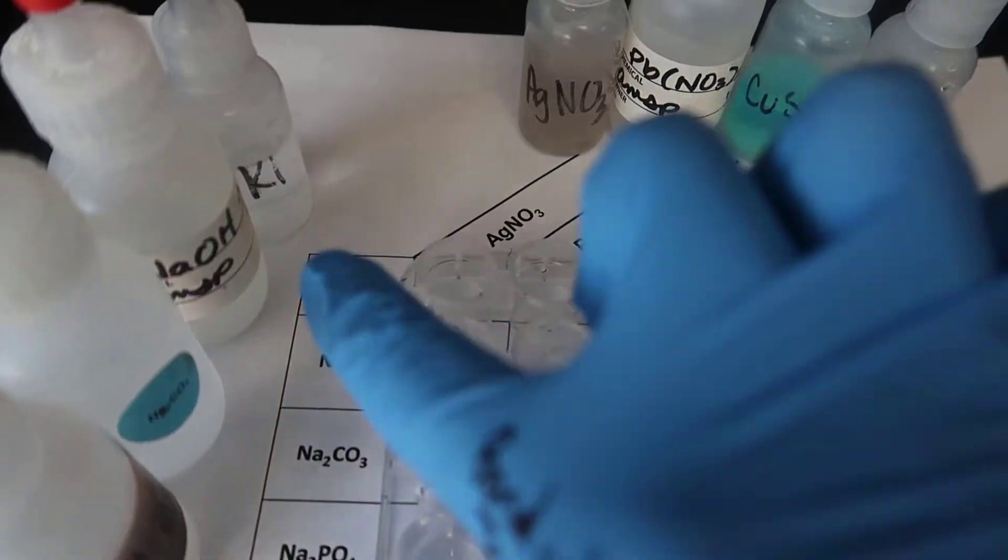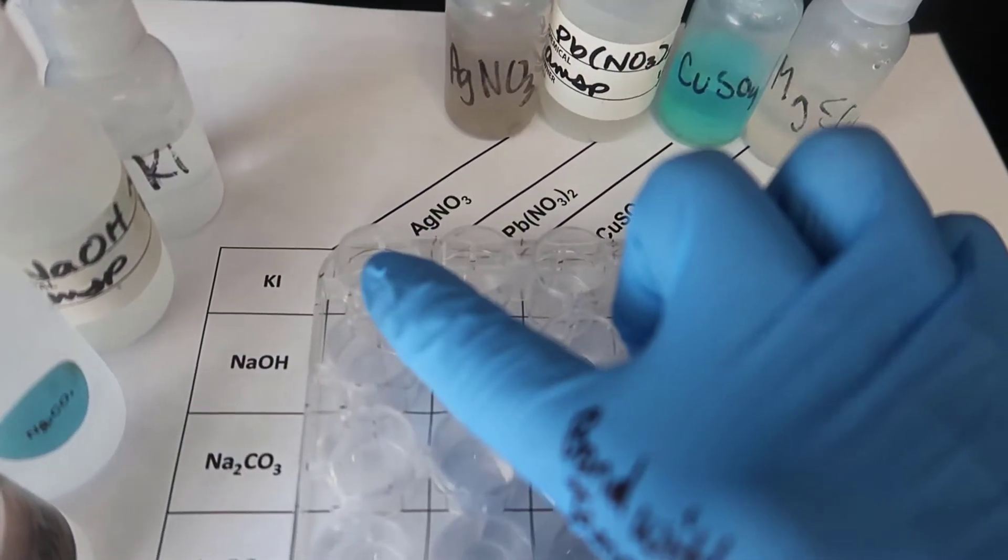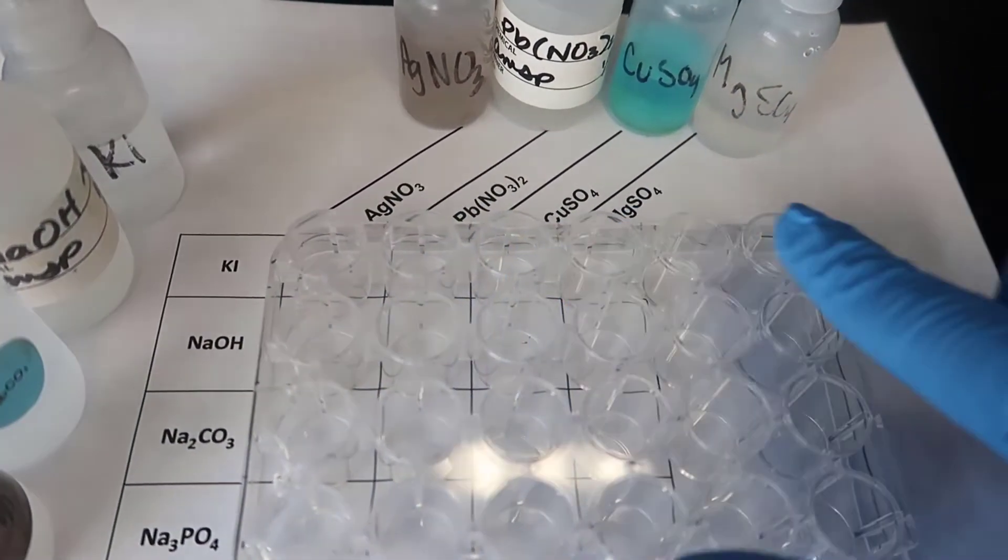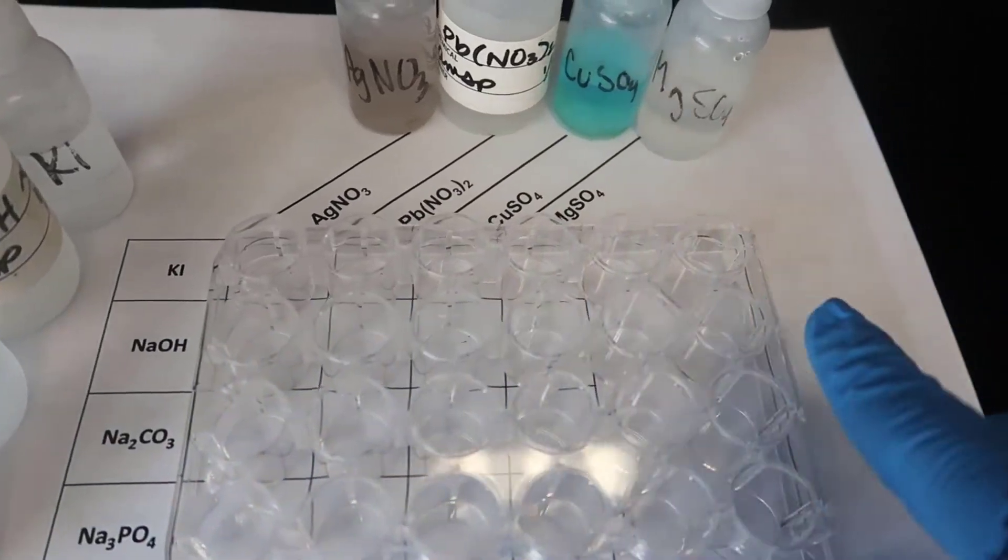So, for example, I am going to take two drops of KI, place it right here, two drops of KI all the way across, two drops of NaOH all the way across.